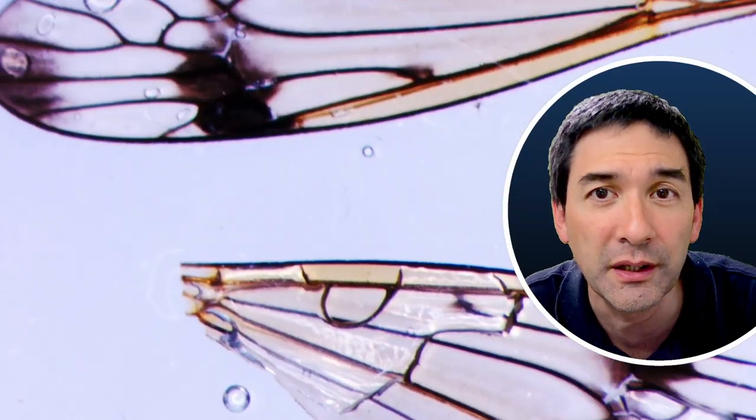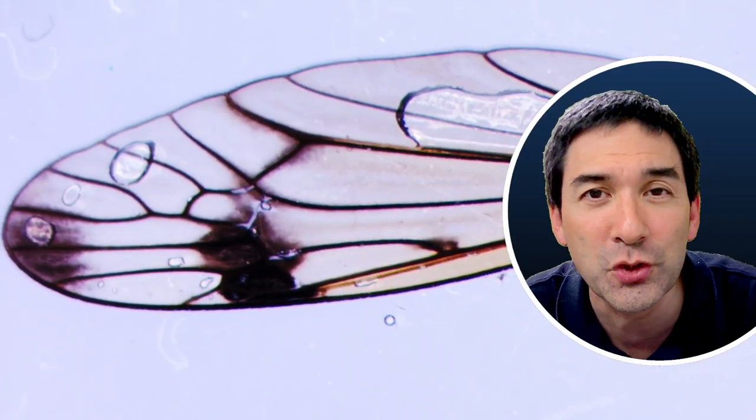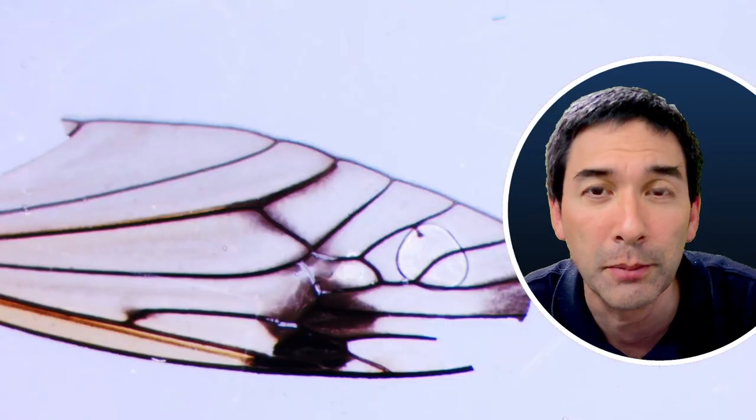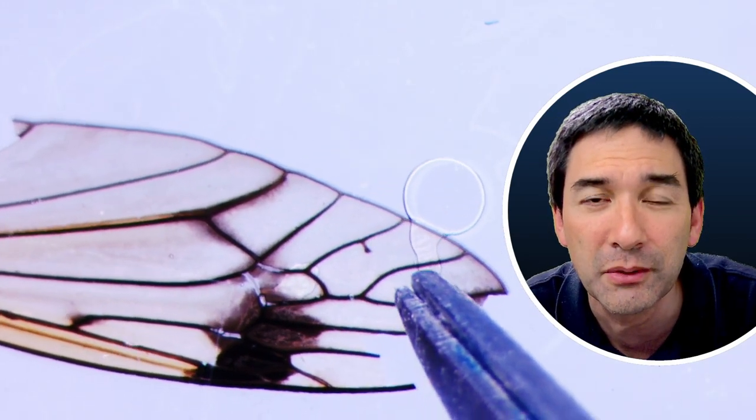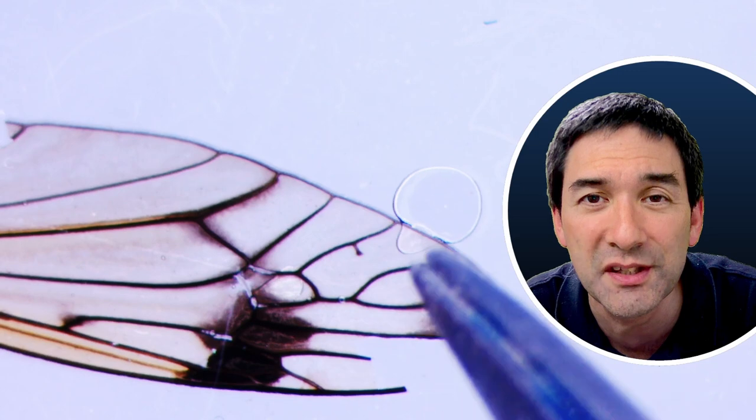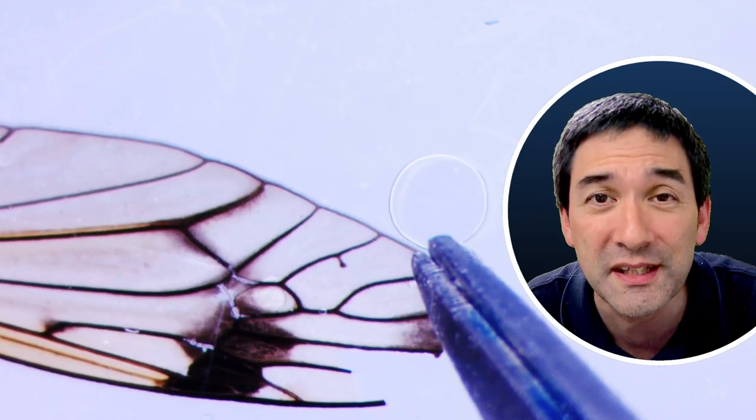Now I put it under my stereo microscope and I could see that there are quite a lot of bubbles, air bubbles, because beneath the wing or on top of it the air bubbles could not escape. So I carefully used my tweezers to press against the cover glass.